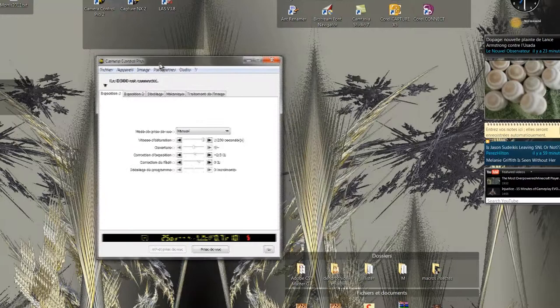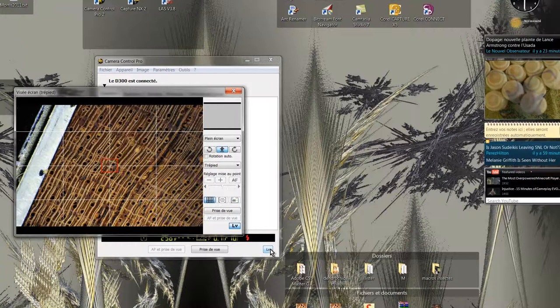I'm seeing my sample in this window. I will center and then align it in the window.